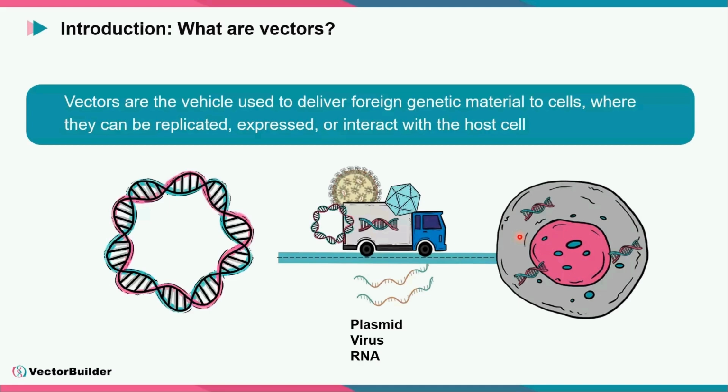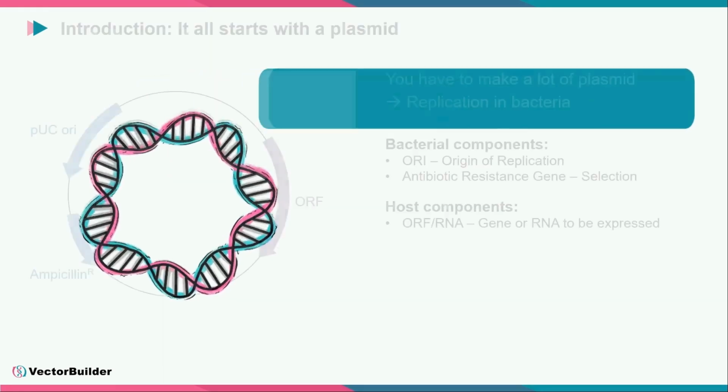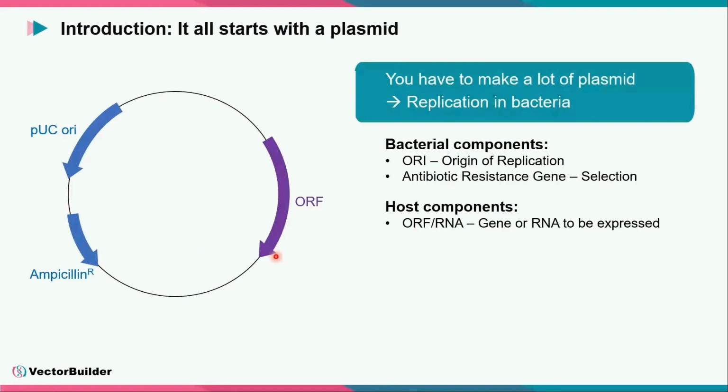But regardless of what application you use or what delivery system you use, luckily it all really starts the exact same way. It all starts with a plasmid. And probably you have encountered plasmids in one context or another, but we do often overlook the basic components of a plasmid, especially if you're just using one that's been in your lab forever or you've ordered one and you're using it as is.